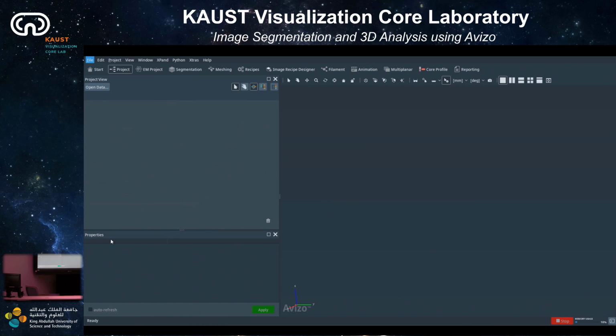It depends on whether you have porosity. Sometimes if you apply a filter, you might lose the information of porosity. It depends on the type of porosity. If you see that the filter reduces or closes the porosity, it's very subjective to you.